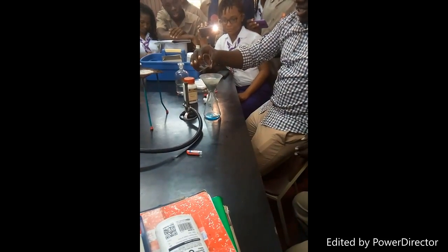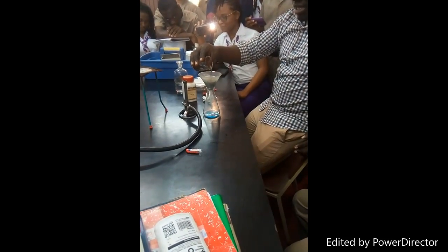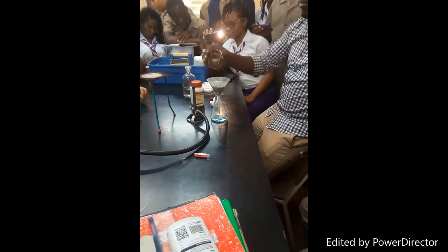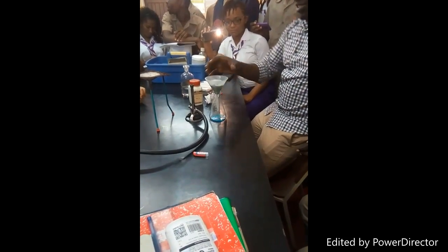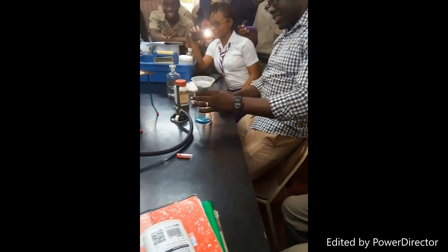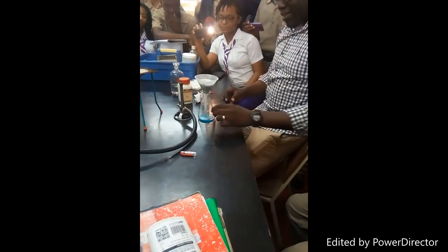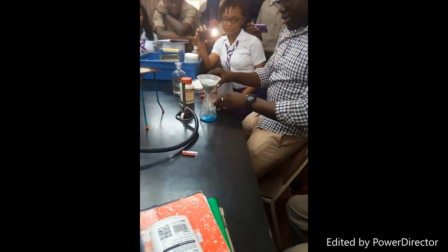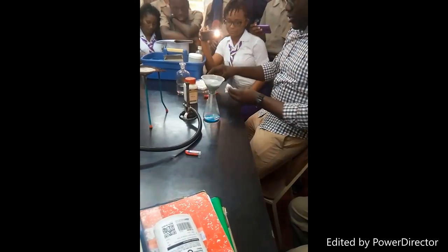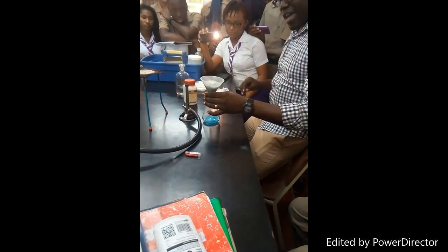So it's not like magic. Inside this we should now have copper sulfate and water. We're just going to leave that to filter for a while.